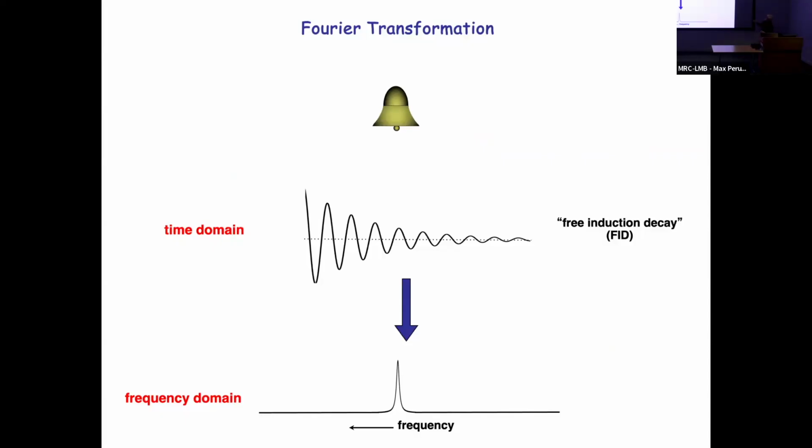The idea is if we take a resonator, it's depicted here as a bell. Bells have overtones and different harmonics. In this analogy, we have a bell that is a simple harmonic oscillator that has a single resonant frequency. If we take that bell, put it in a box and shake it up, what we would see is a decaying sinusoid, and we can then pass that through a Fourier transform and extract what the frequency component of that is.